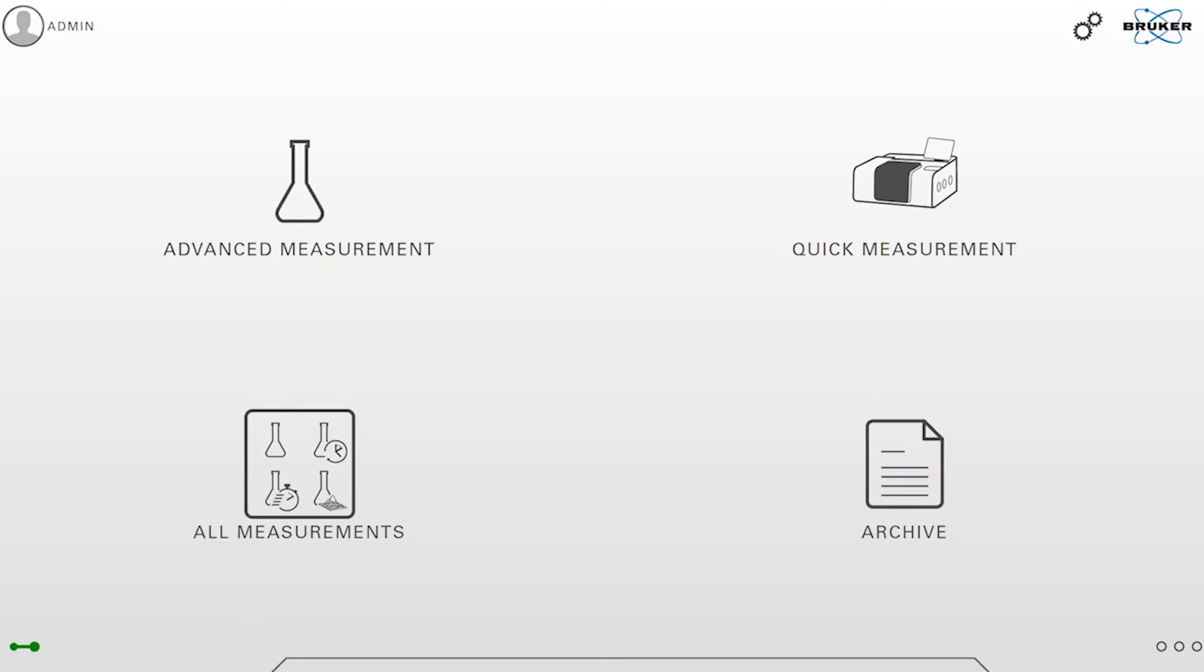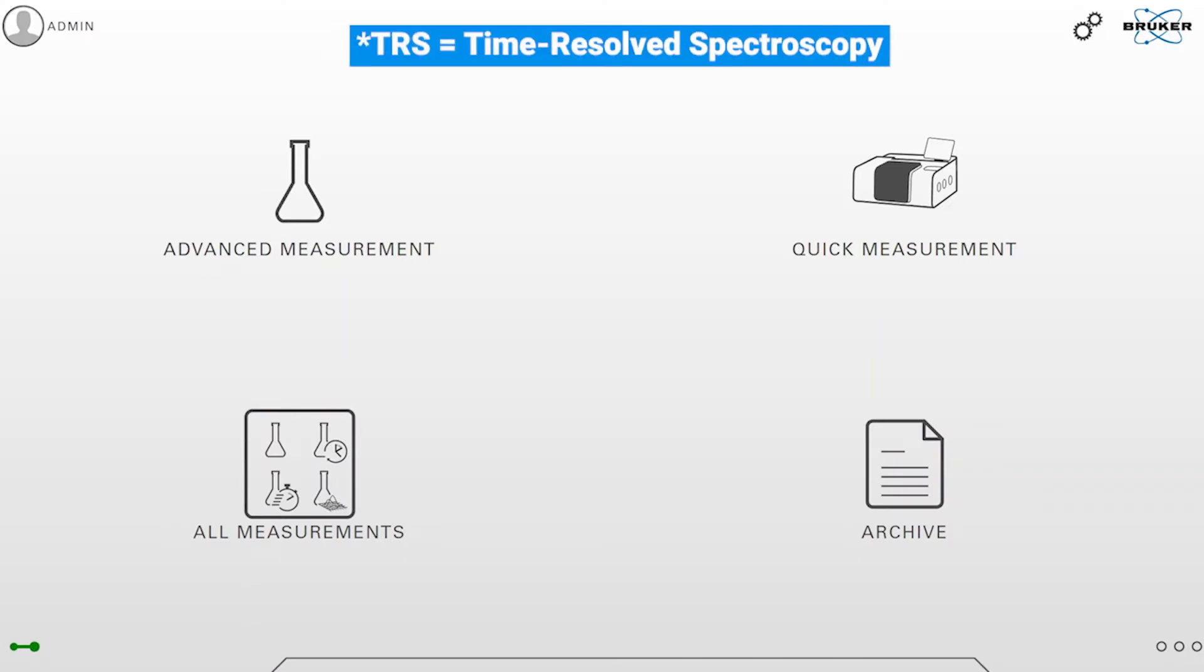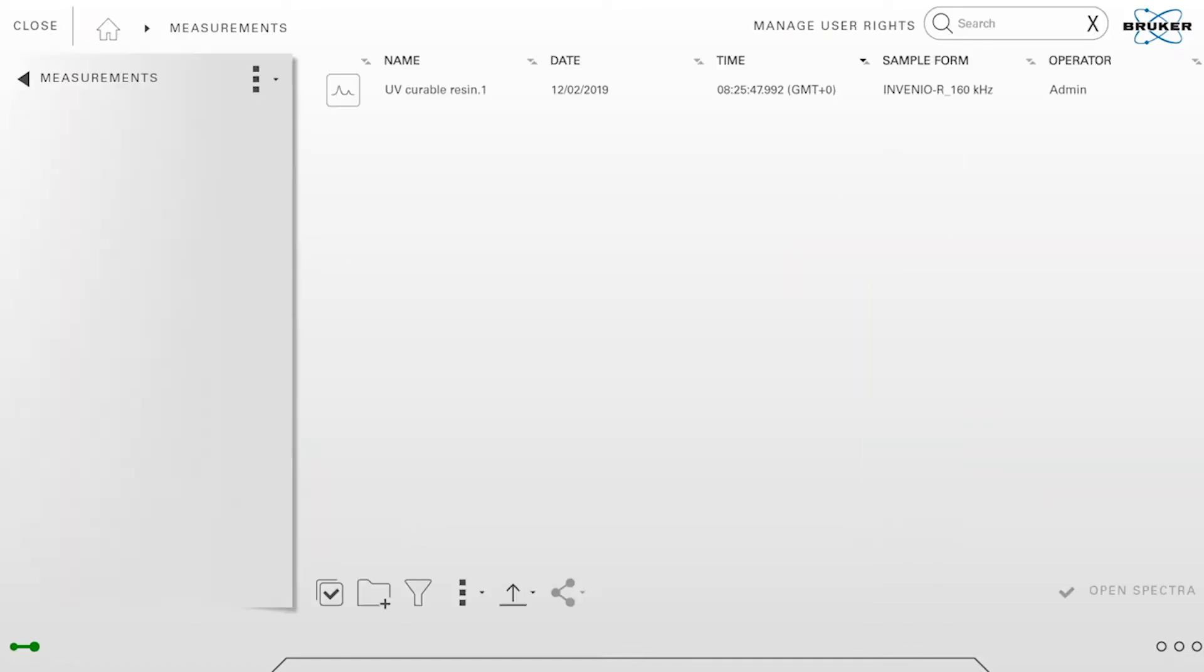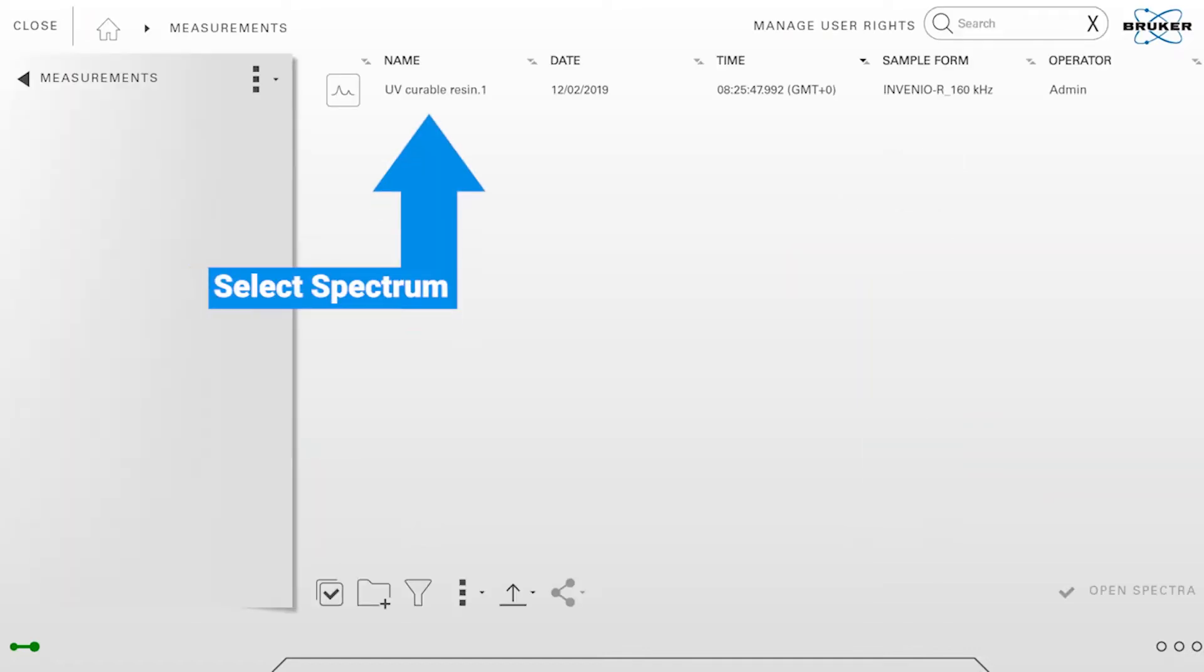In this lesson you're going to learn about our TRS result view. This result view can visualize 3D data which was acquired with one of our time-resolved spectroscopy measurement functions. I will show it on an example file which I have measured with rapid scan.